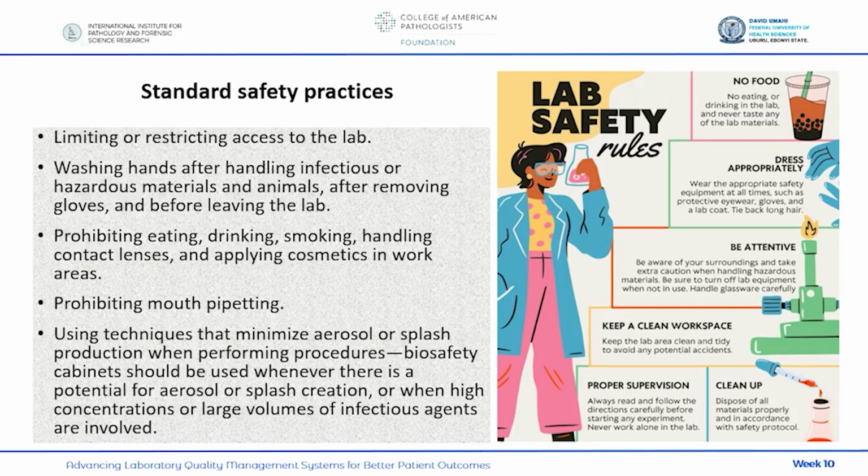After you remove your gloves, you are expected to wash your hands. Before you leave the lab, you're expected to wash your hands. So hand hygiene is very important as a safety practice in the lab. Of course, you're not allowed to eat, drink, smoke, handle contact lenses, or apply cosmetics in work areas. These are prohibited, not allowed.